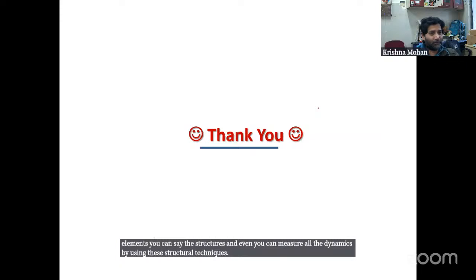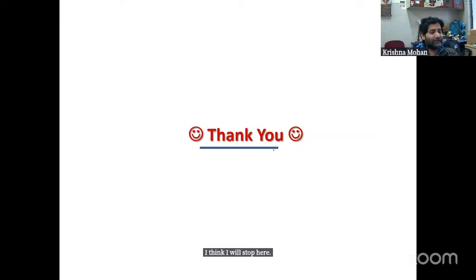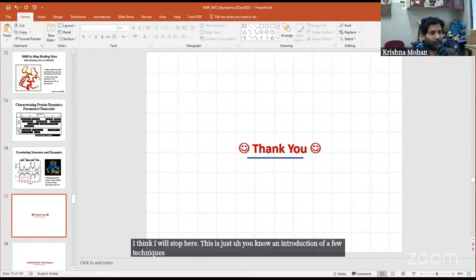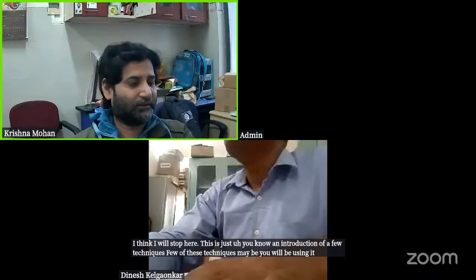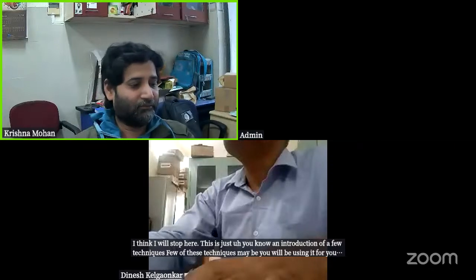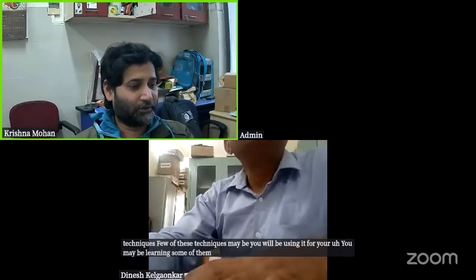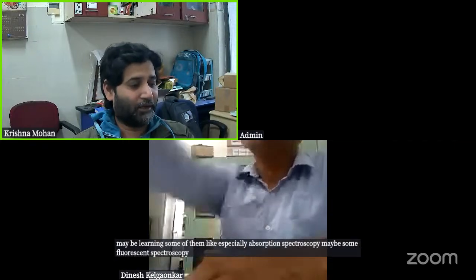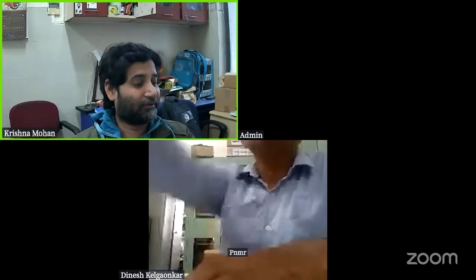I think I will stop here. This is just an introduction to a few techniques. A few of these you may be using or learning, especially absorption spectroscopy, maybe fluorescence spectroscopy, NMR, maybe single crystal analysis for your small molecules.